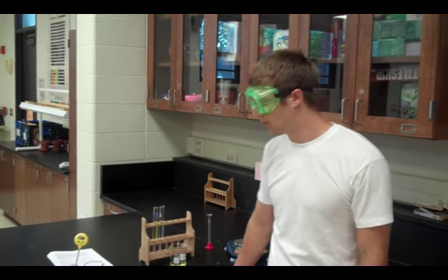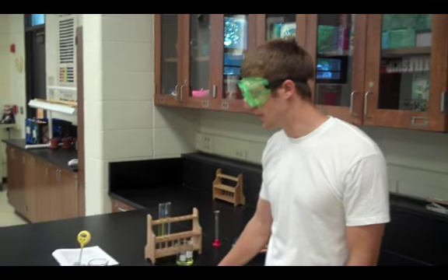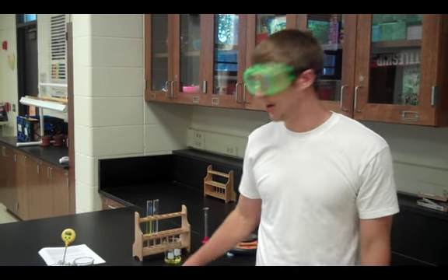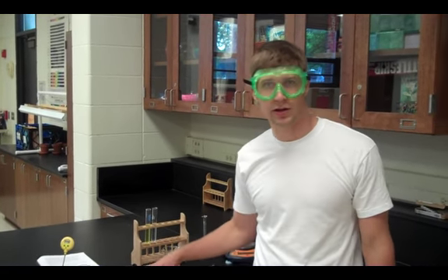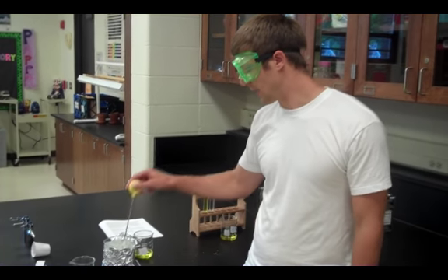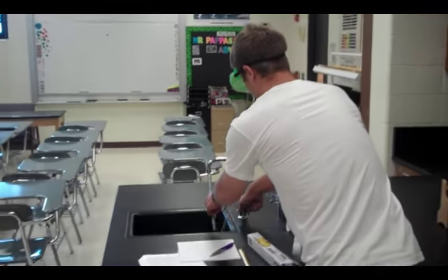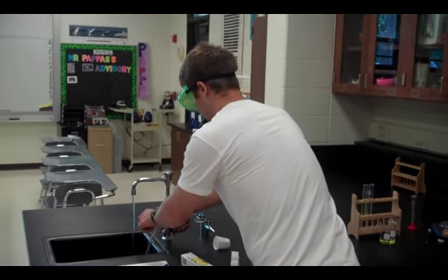So once you've found the freezing point for all 3 of your test tubes, the water, solution A, and solution B, it's going to be time to clean up. Now we need to take some special precautions when we're cleaning up with antifreeze because it's not something that we want to put down the sink. So I can take out my thermometer and rinse that off really well in the sink.